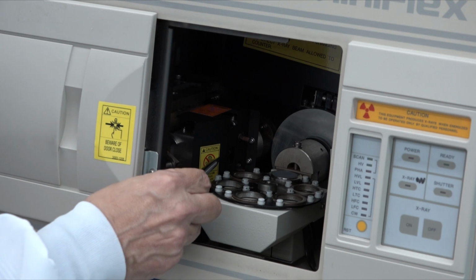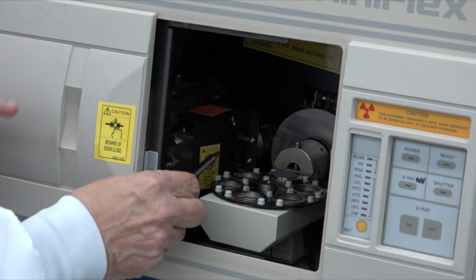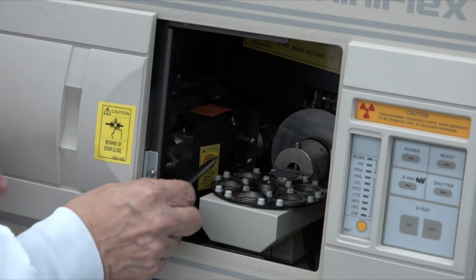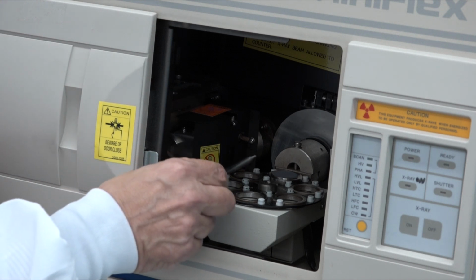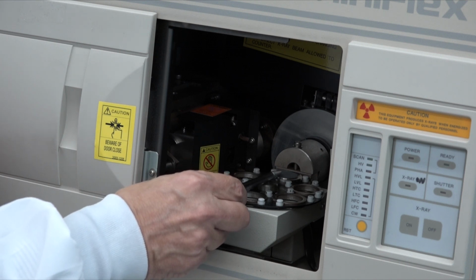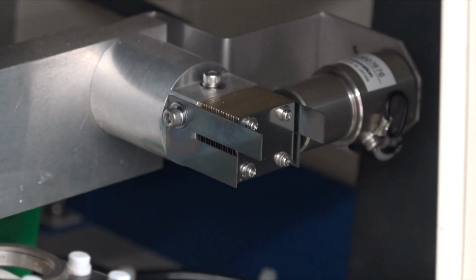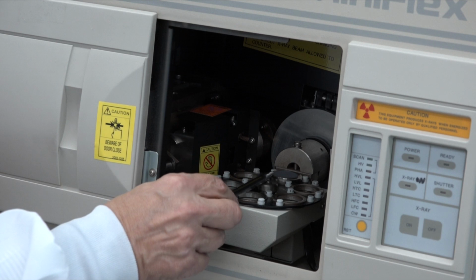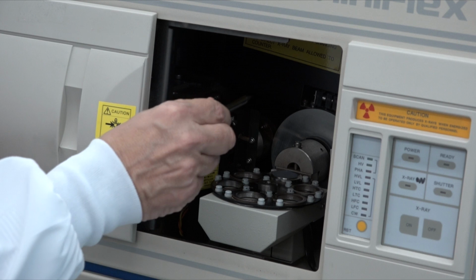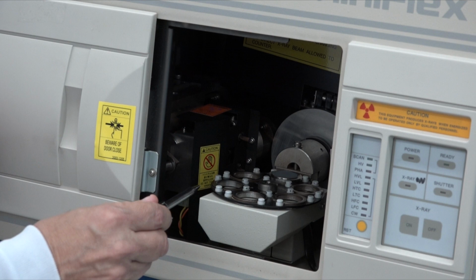Over here is where the X-ray tube is. There's an interlock shutter so that with the door open, the shutter automatically closes. When this door is closed, the shutter opens and X-rays irradiate the sample. Okay? The X-rays are then diffracted by the sample, and they go off up here where there is a detector. The sample stage rotates through an angle of theta when the detector rotates through an angle of 2 theta. Very common X-ray powder diffraction geometry.